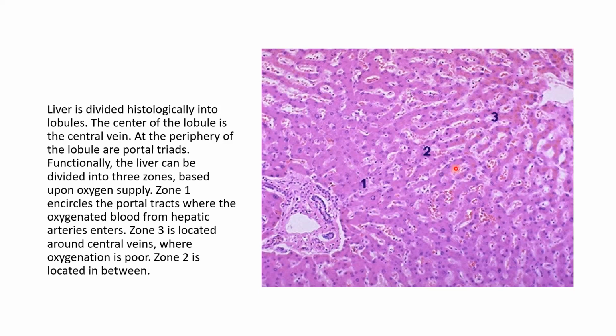As you can see, we said the normal histology of the liver consists of hepatocytic plates. You can see how the hepatocytes are arranged in plates. In between these plates run the sinusoids. You can see here the spaces which are filled with blood, with RBCs. These are the sinusoids. And we said sinusoids are the first blood vessels to be affected if I have fibrosis, an injury that ends up in fibrosis. The level of the sinusoidal blood vessels is the first to be affected.